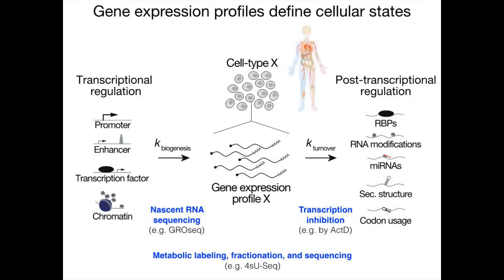However, like any biochemical separation methods, the underlying protocols are laborious, require ample starting material, and typically encounter the problem of low signal-to-noise performance, in part because of limited biotinylation efficiencies. And again, such strategies are really not readily scalable. Furthermore, the analysis of labeled RNA transcripts by biochemical fractionation, followed by sequencing, requires extensive controls. So one really needs to sequence 3 samples per time point, the input, the fractionated RNA, as well as the flow-through, in order to provide integrative insights into gene expression dynamics. And it fails to report global effects unless spiking strategies are applied.